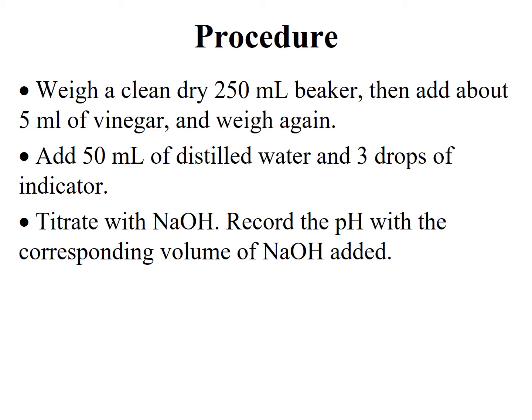So both part A and part B will be done twice. So you're going to repeat again both parts of the experiment.